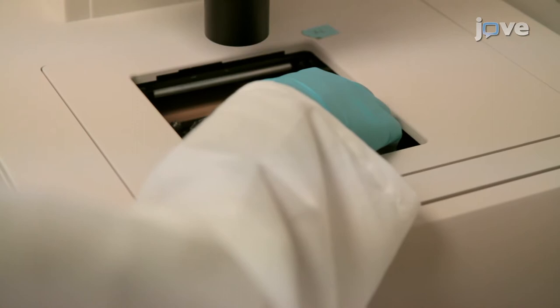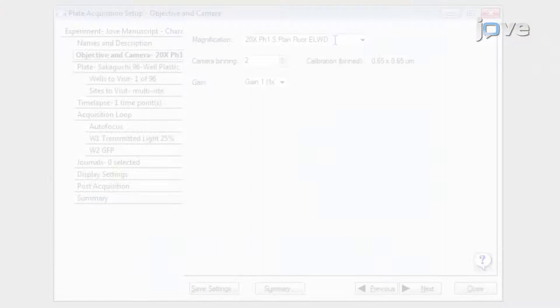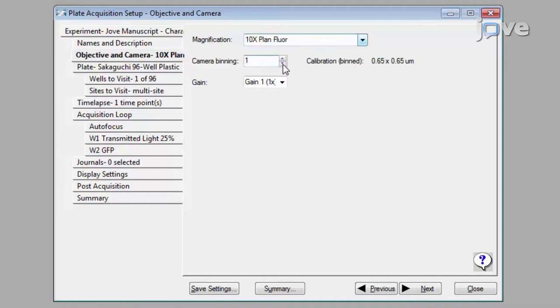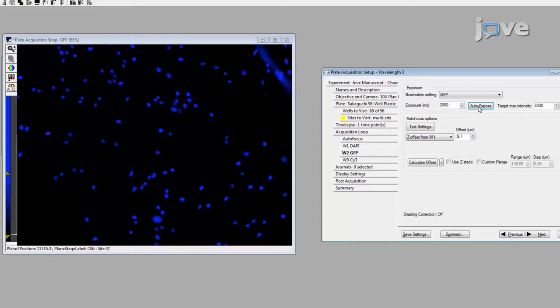To perform automated imaging, load the immuno-labeled plate into the HCS system and allow the plate to equilibrate for 20 minutes. Open the HCS system image acquisition and analysis software. Choose the acquisition settings for the 10x objective using camera binning at 1 and a gain setting of 2. Use the auto-exposure function to find the Z-plane in which the cells reside and calculate the offset for each wavelength of interest.